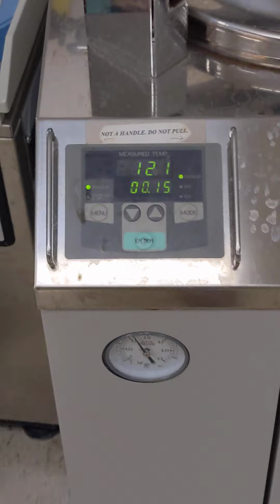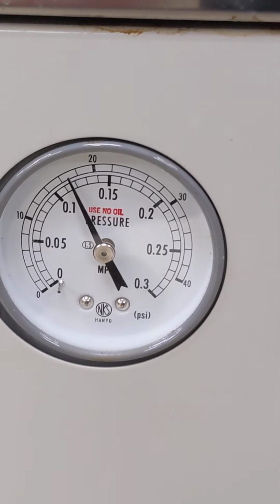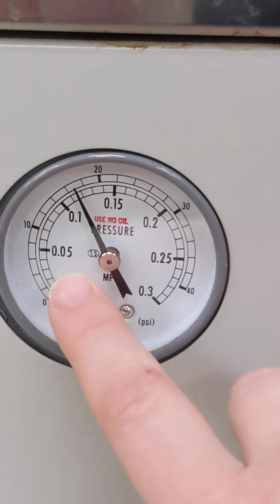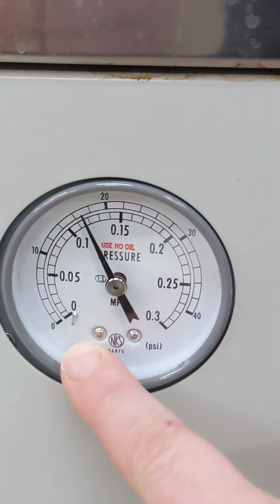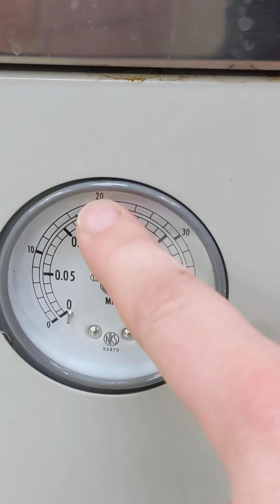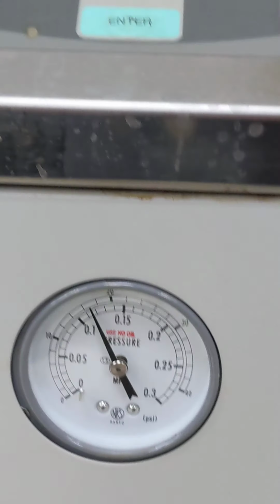Now this machine is under a lot of pressure. So let's go down here to the pressure gauge. You can see here, if we were at atmospheric pressure, we'd be way down here at the 0. So this is how much pressure has been built up inside of the machine. This is a great zone. This is where we want to be. We're not in the critical area, and we're not here at atmospheric.